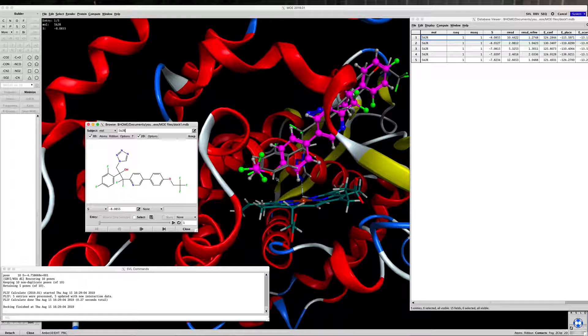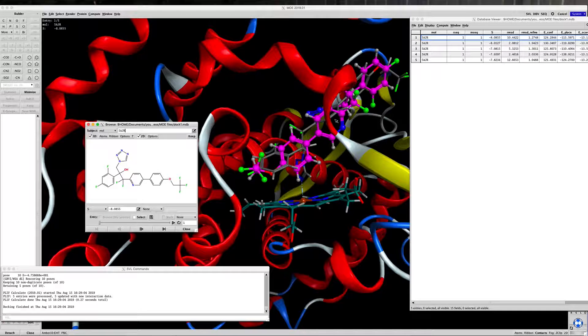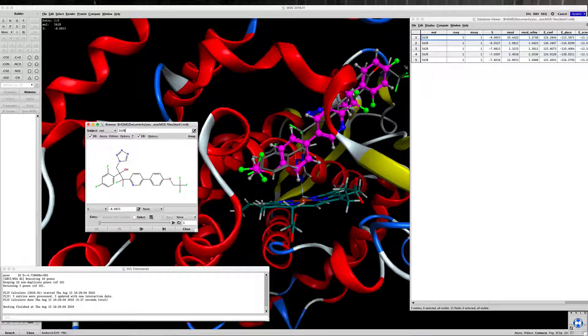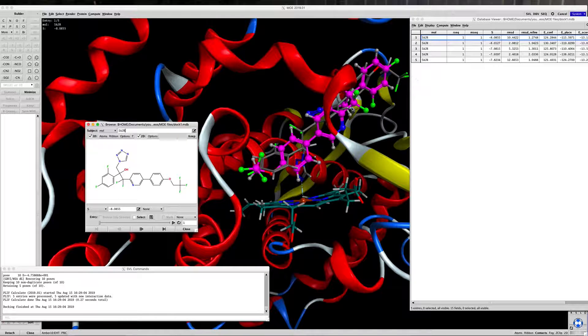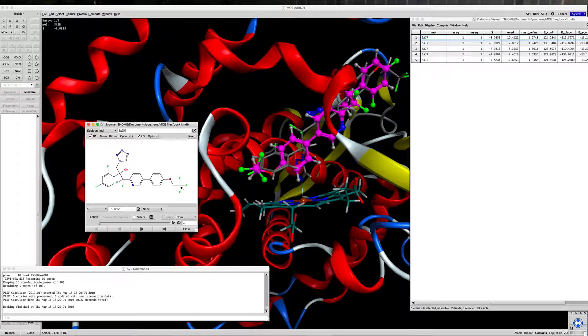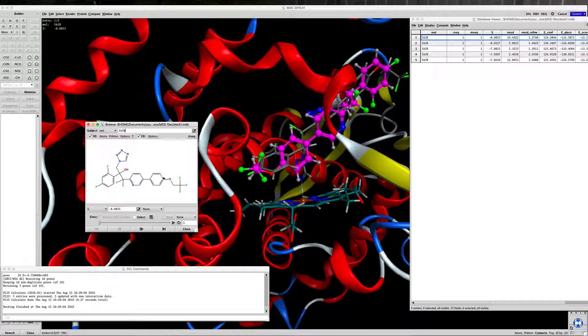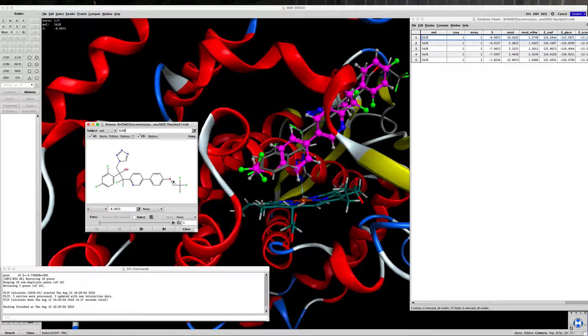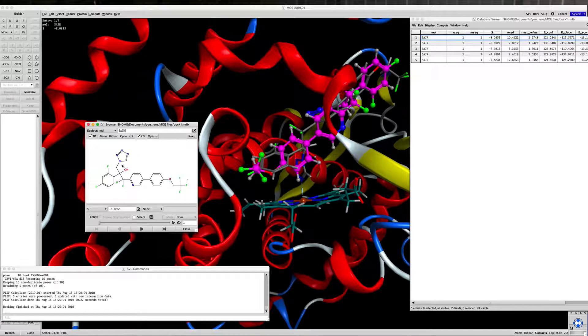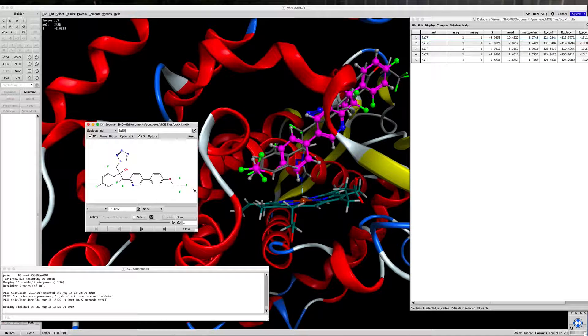What the receptor is doing, though, is the channel is very lipophilic, and it's matching up all of these lipophilic groups in this ligand with lipophilic centers along the channel.